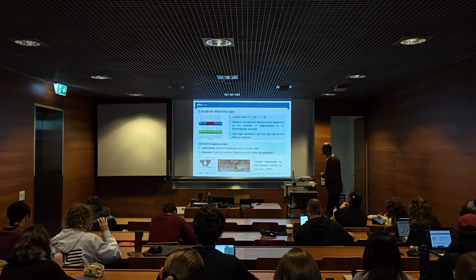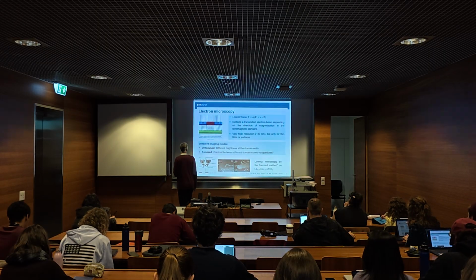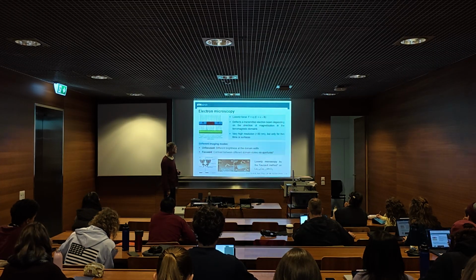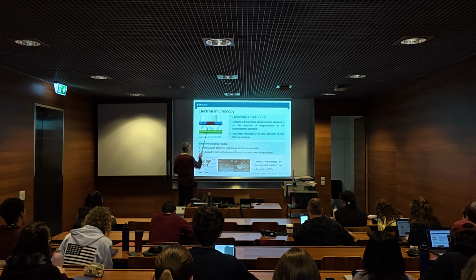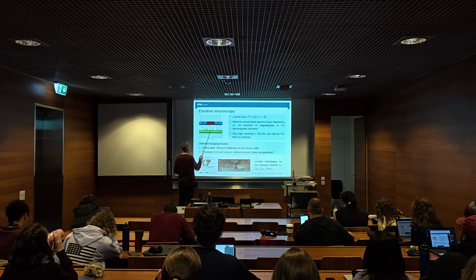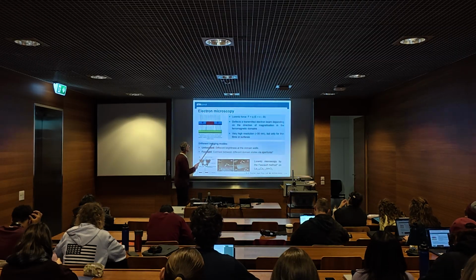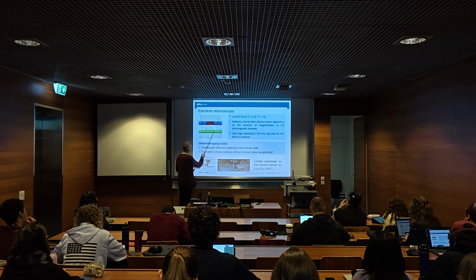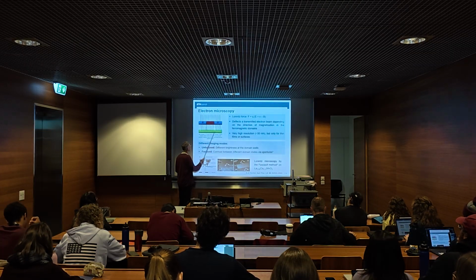Electron microscopy can nicely see magnetic domains, because electrons are influenced in their path by magnetization through the Lorentz force. That means when electrons, as a wavefront, go through a ferromagnetic material, one magnetization direction would deviate the electrons in one direction, and the opposite magnetization would deviate them in the opposite direction. And then you get regions at the domain walls that get no electrons, or twice the number, and you can see the domain walls based on these deflections.